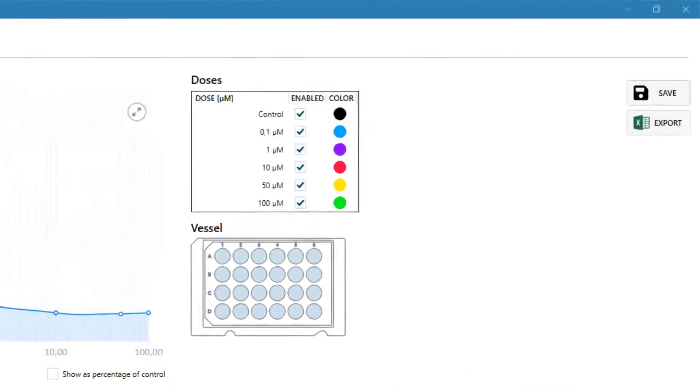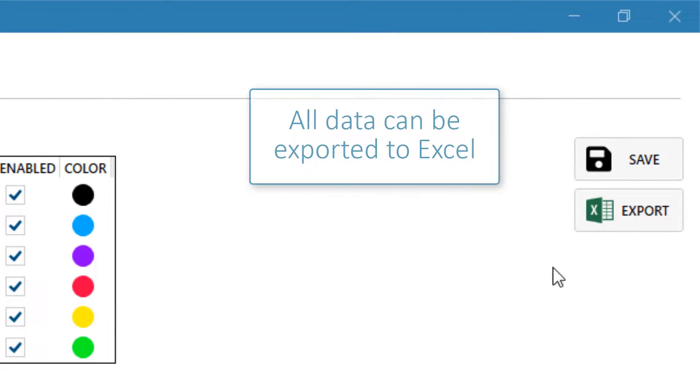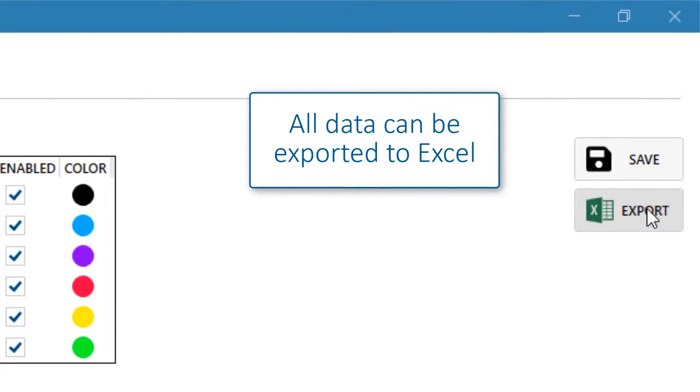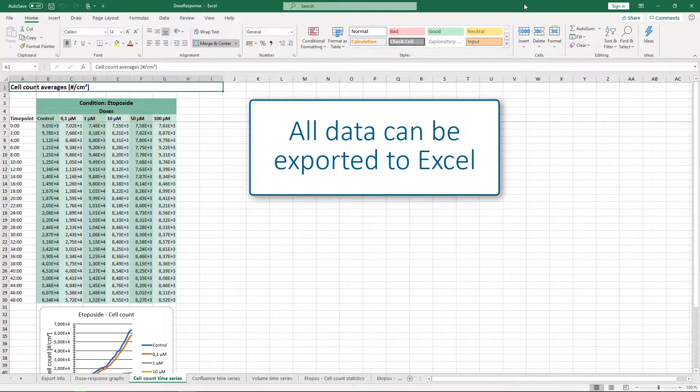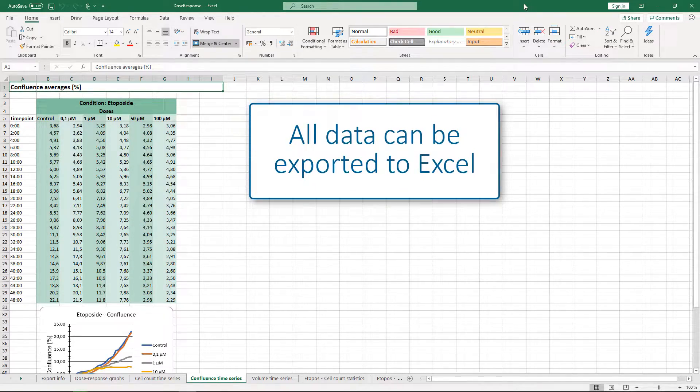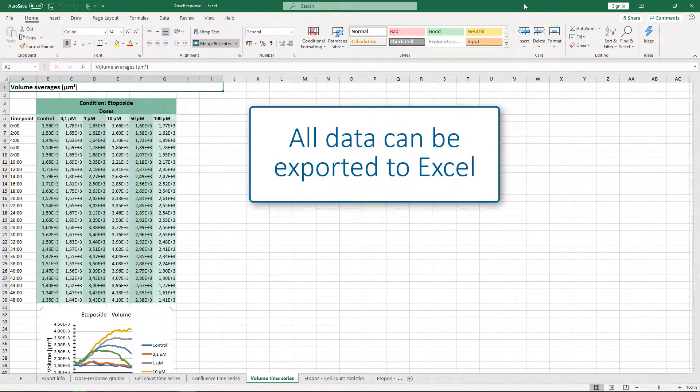Of course, you can export all underlying data to Excel if you want to do your own analysis and graphs.